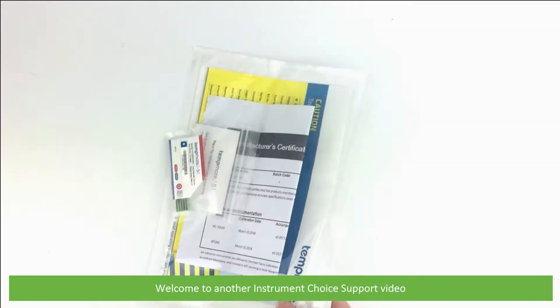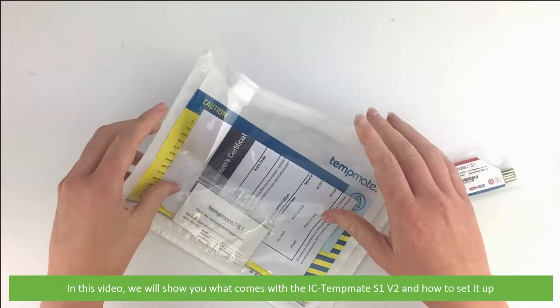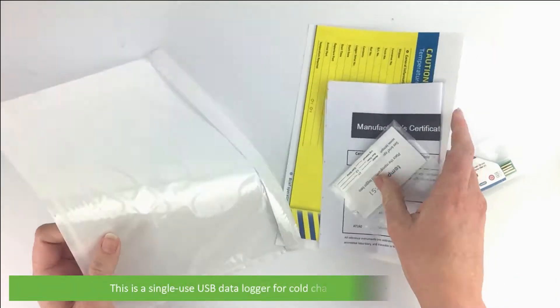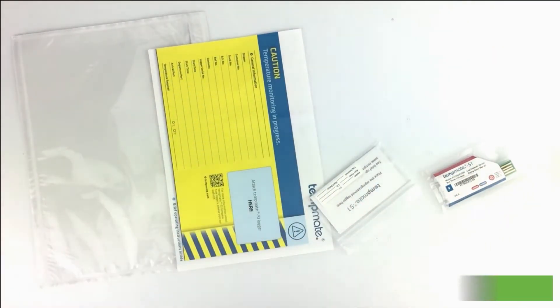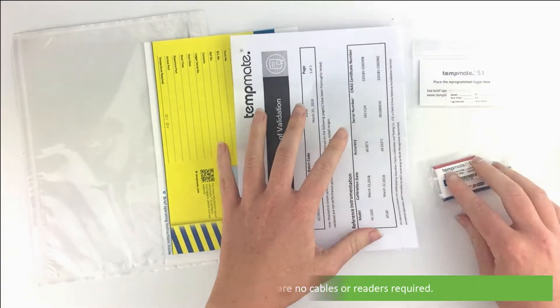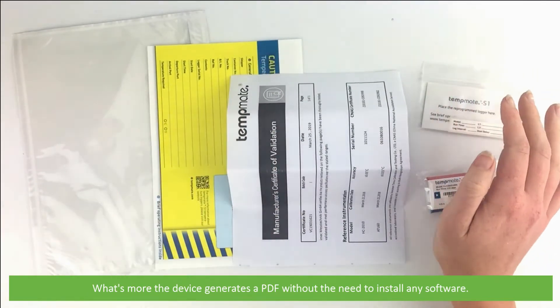Hi and welcome to another Instrument Choice support video. In this video we will show you what comes with the IC TempMate S1v2 and how to set it up. This is a single-use USB data logger for cold chain temperature monitoring. With the built-in USB port there are no cables or readers required. What's more, the device generates a PDF without the need to install any software.